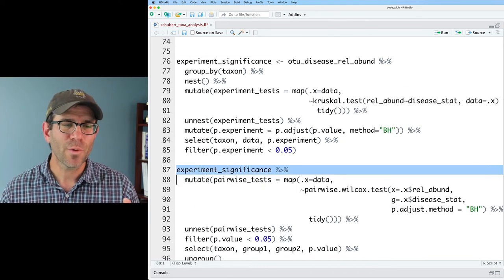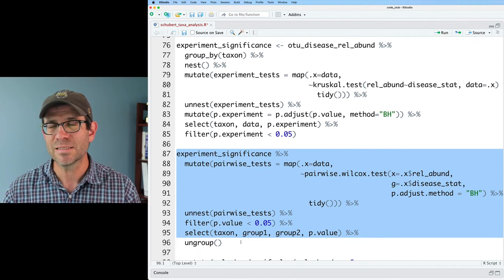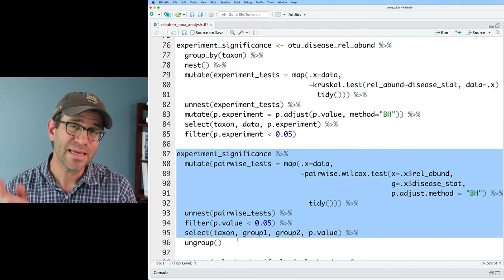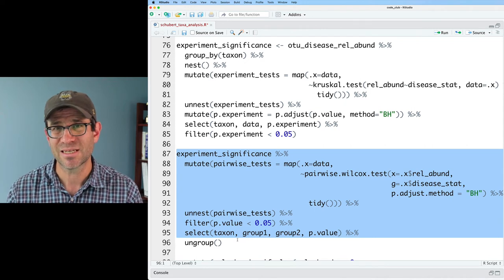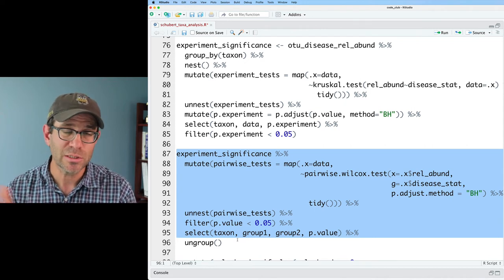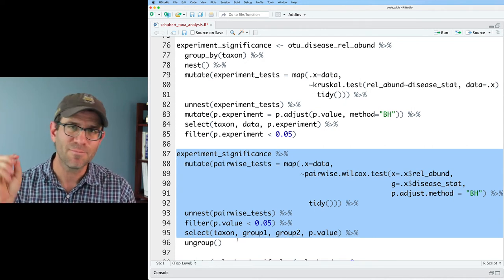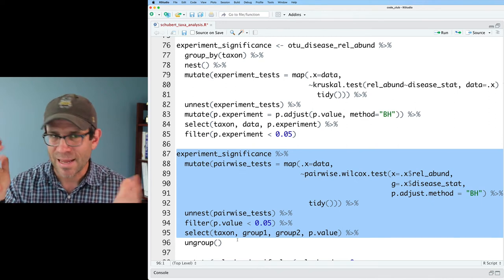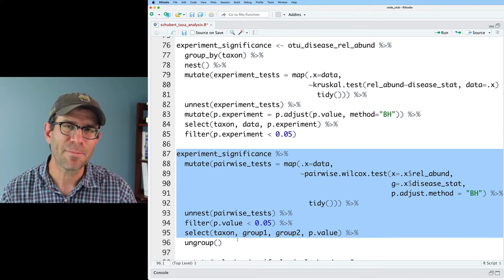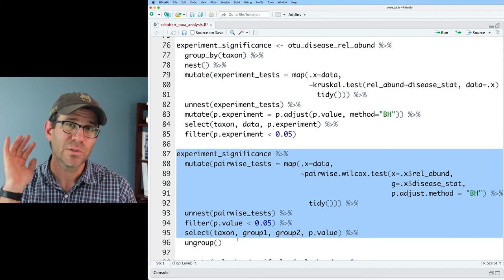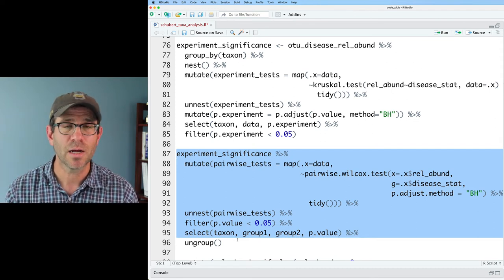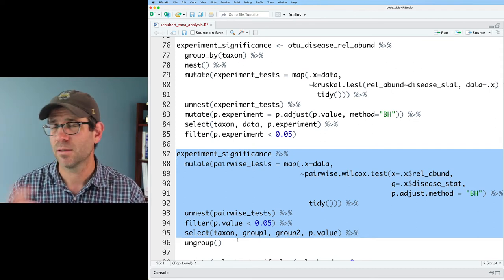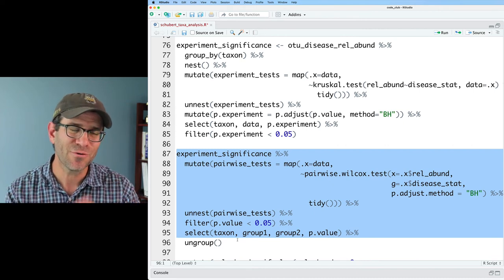What we're going to do in the next episode is take the result of these pairwise tests and use that to annotate our figure to show which comparisons are significantly different and which ones aren't significantly different by kind of putting in some stars and bars and NSs to make those comparisons on our plot. So it's easier to see when you look at those relative abundance plots, which comparisons are significant and which ones aren't. So stay tuned for that.